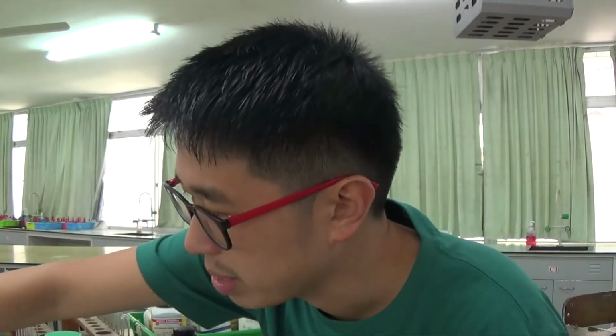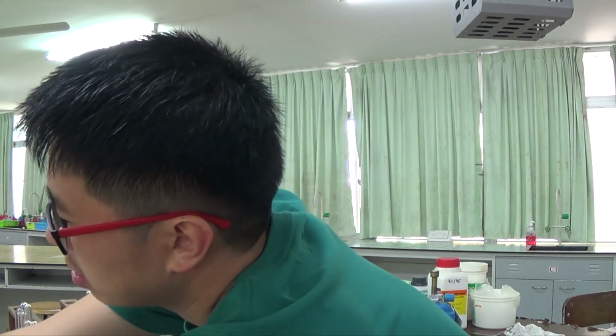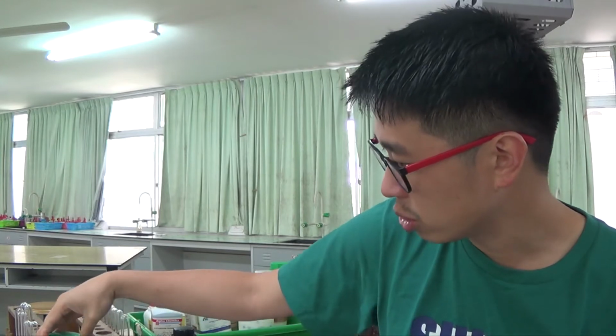It forms colored compounds, and most likely, depending on concentration, it will also give you colored solution. I said depending on concentration because if your concentration is very dilute, it might look almost colorless, such as this manganese 2+, which I'll show you in a little bit.